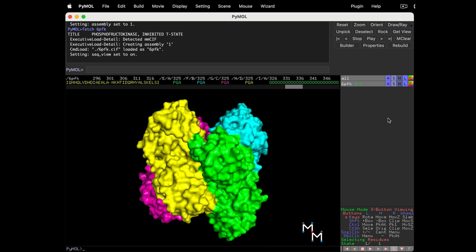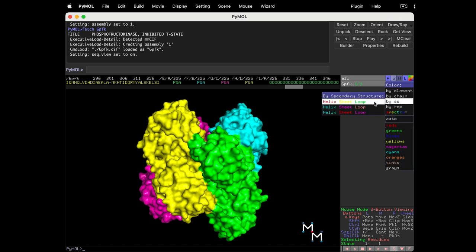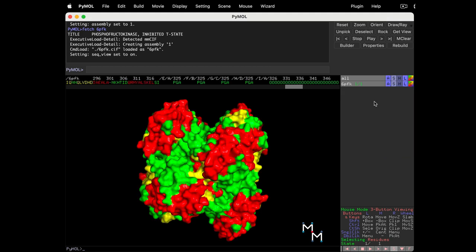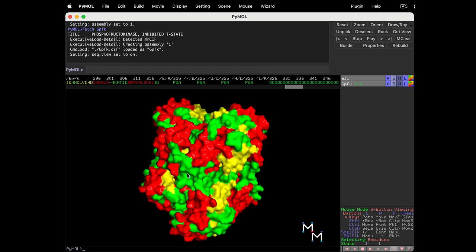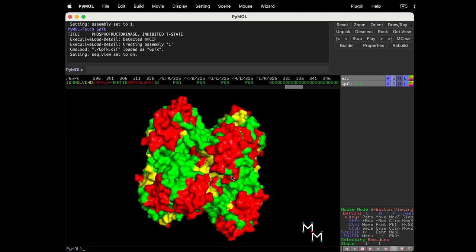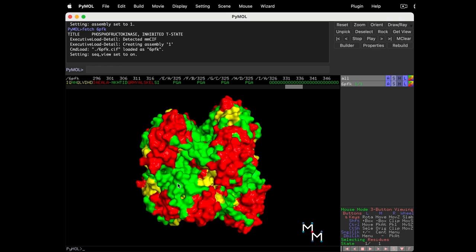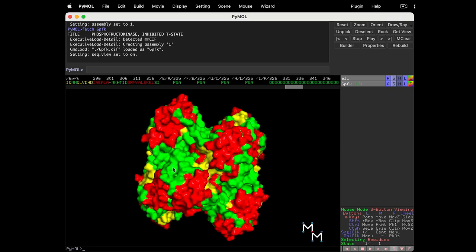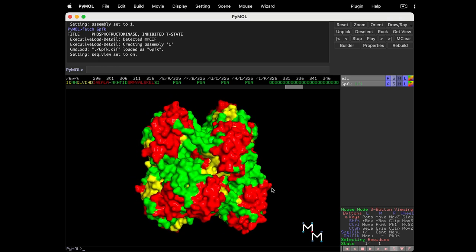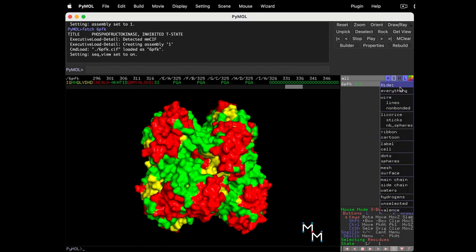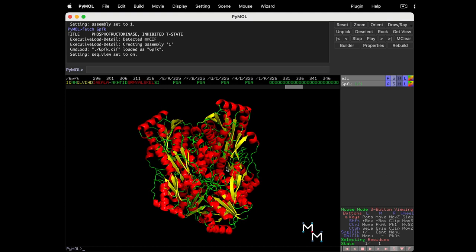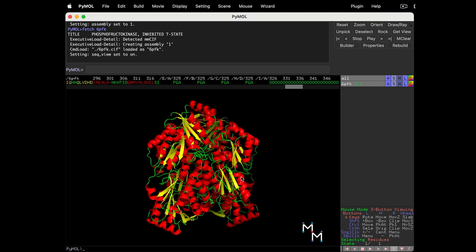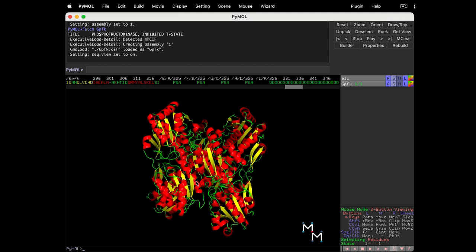Now, let's color by SS, secondary structure. This highlights alpha helices, beta sheets, and areas of the protein without a defined secondary structure called loops. But this rendering isn't super useful with the protein shown as surface, since the bumpy surface obscures the secondary structure. Hide the surface to reveal the cartoon beneath. Now that's cool, and very useful.